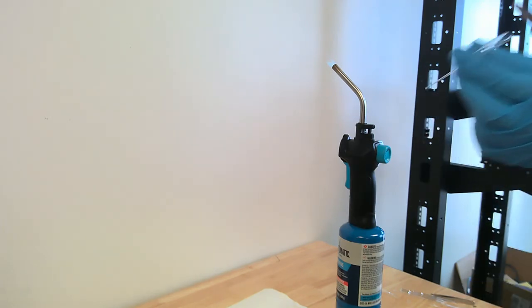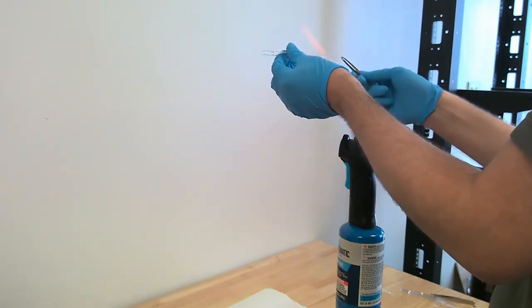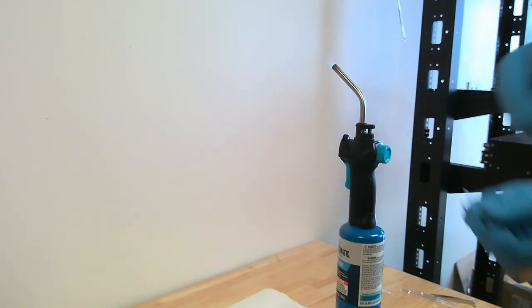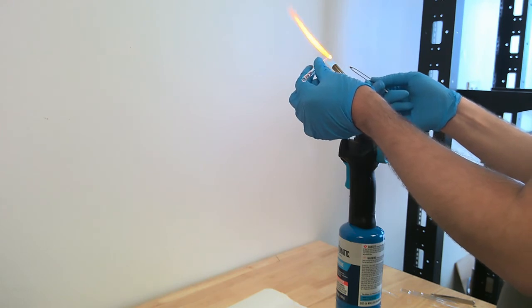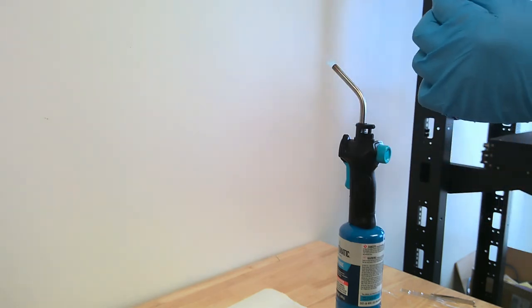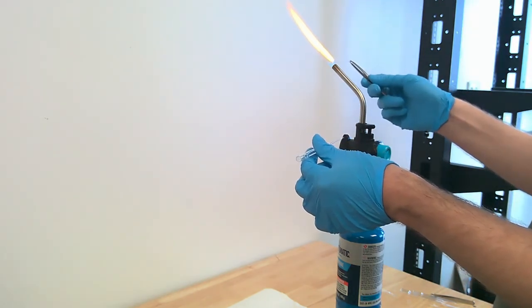So you're going to avoid heating close to the solid. You're going to heat away from the solid. You don't want to trigger undesired chemical decomposition at high heats. So we're going to hold far away from the tip, and it may curve like this. It's not uncommon for it to curve. You're going to want to make sure the opposite end is secure, and we're going to very carefully seal off. I'm going to continue to seal off the top end of our capillary, and I'm going to really make sure it's flame polished.